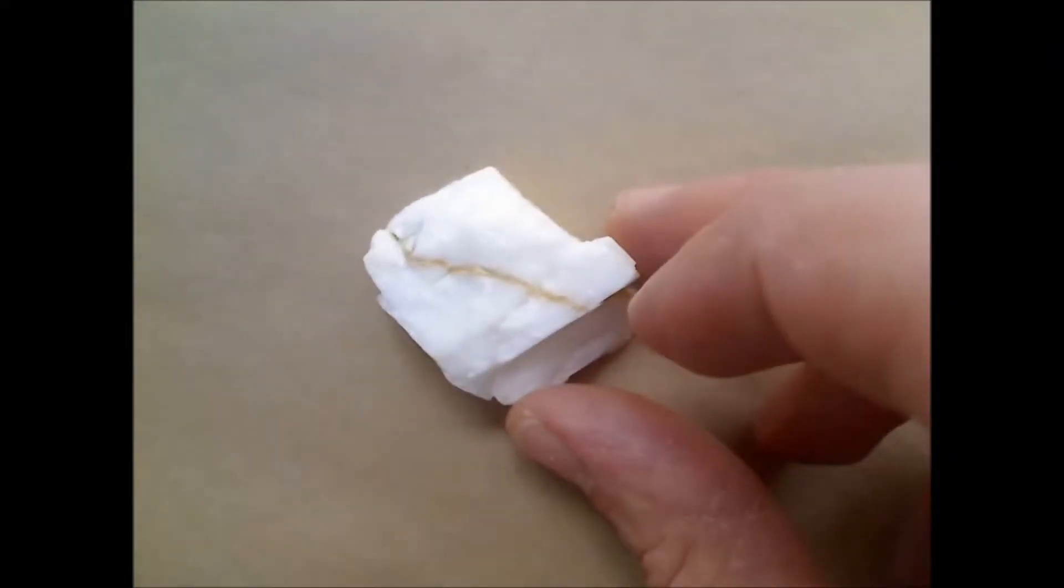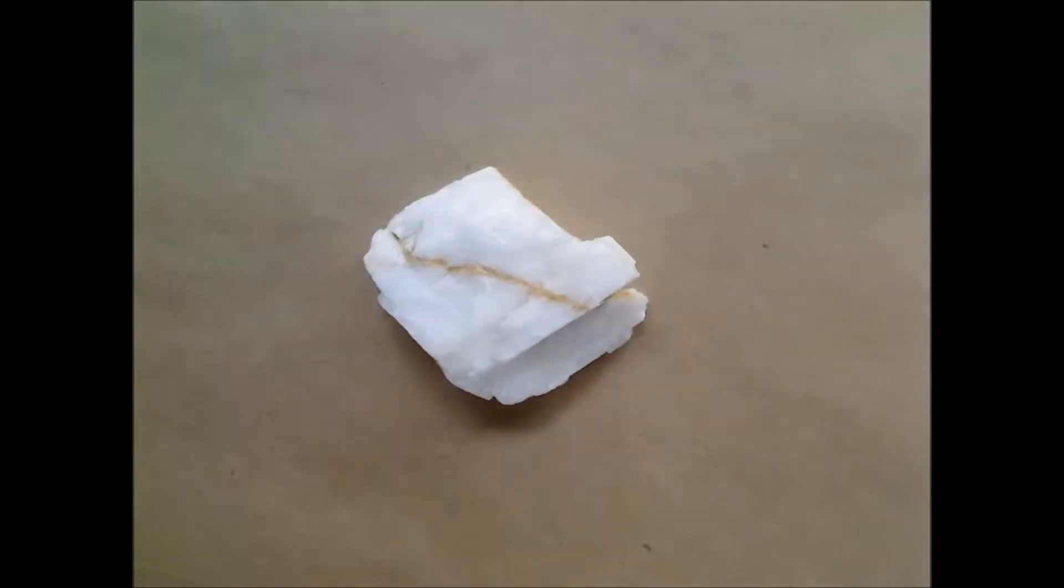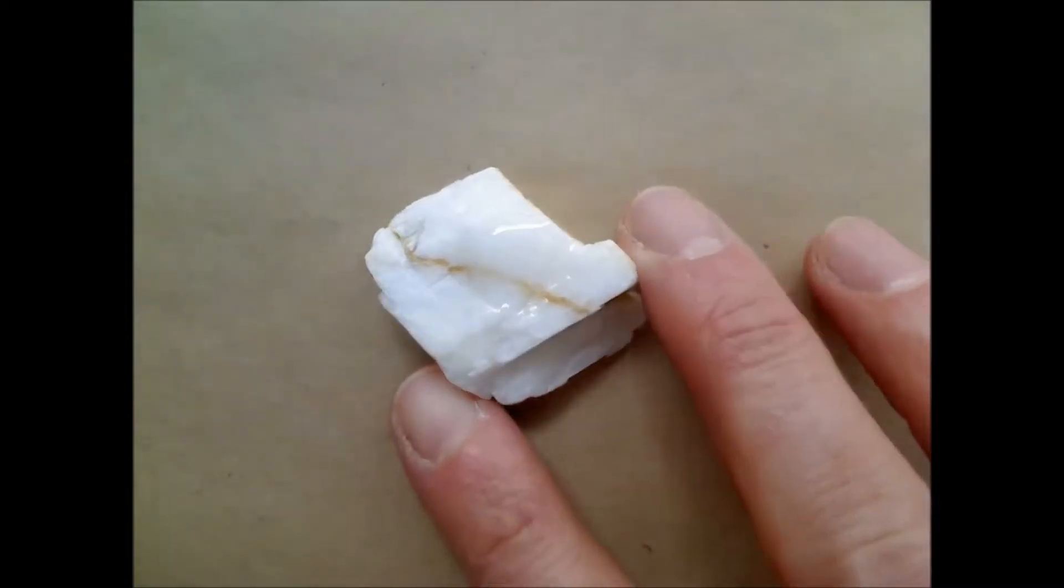So I'm going to jump right in here. Here I have the mineral calcite and I have some hydrochloric acid that I'm going to drop on there and hopefully we can see this fizz. Oh, you can see that quite good. So calcite reacts with acid and you see it as it fizzes.